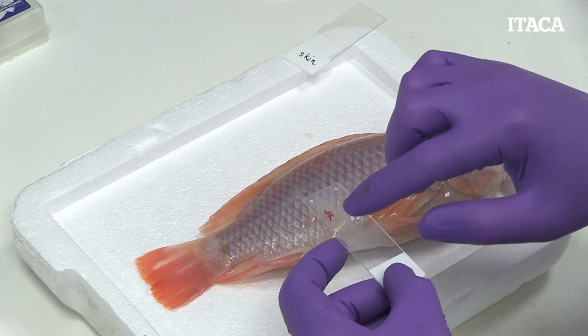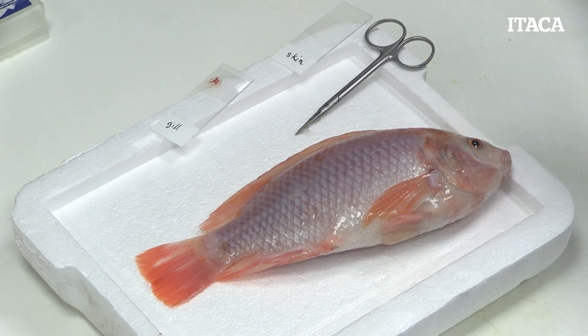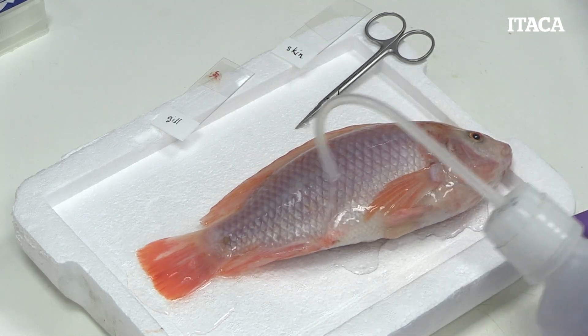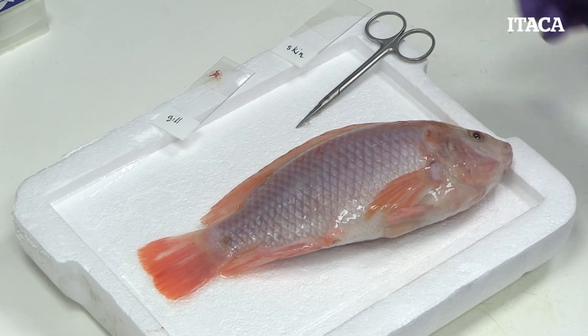We slide that on, and those we'll look at later by microscopy. The next thing we want to do is sterilize the exterior of the fish — we put a bit of ethanol and flood the surface well. We want to sterilize this to make sure that once we open the animal, none of the bacteria from outside the fish get inside the fish.